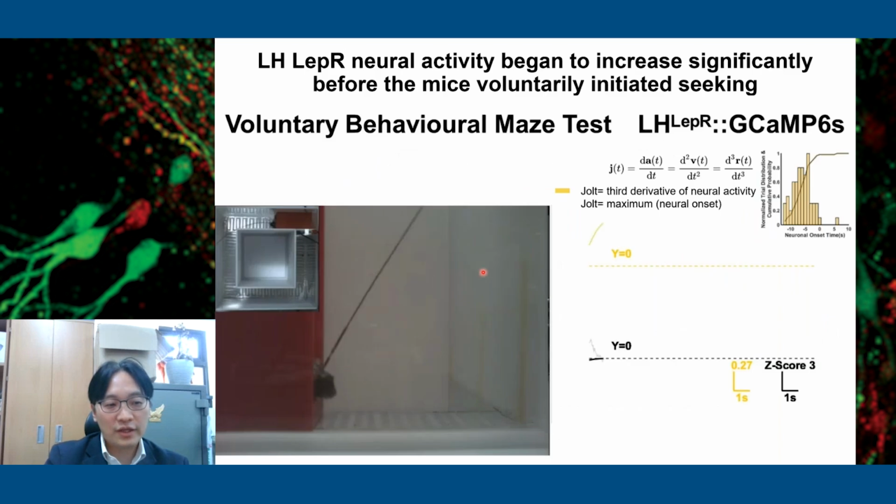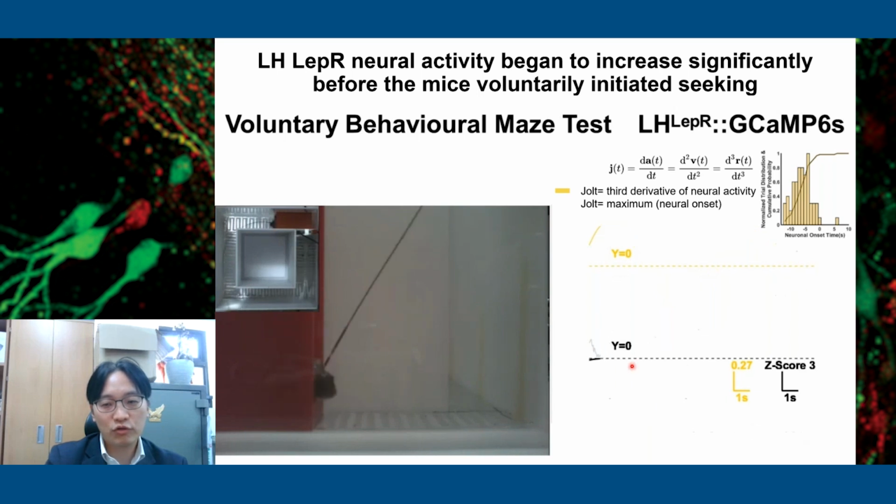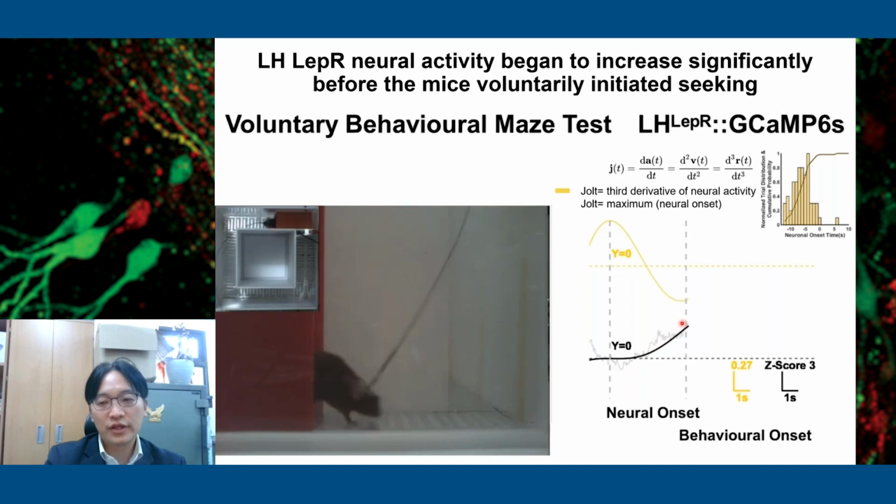So we could know more things about this neural activity. Then we did another interesting study. There's no door, so the mouse has to decide when they want to go. So we could see the ramping of the motivation before the behavior. I will show you again. Should I go? I wanna go. I wanna go. And let's go. So there could be like a 6 second delay between when the motivation goes up and the behavior starts.